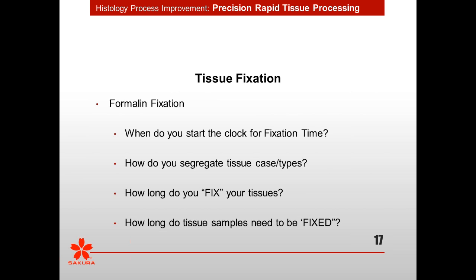Now that we've got to standardization, you're getting tissues in. If you're in a hospital situation, you're probably getting tissues in fresh, and that is a trend that's happening across multiple hospitals. The surgical departments, the other departments don't want the formalin, so they're delivering fresh. So you're going to get fresh tissues. If you have departments that do put in the formalin, you've got a variety of samples in fixative.